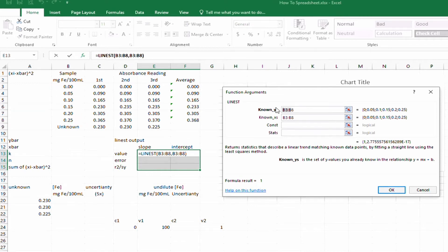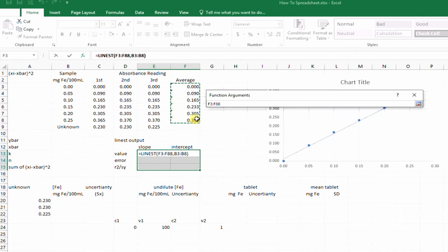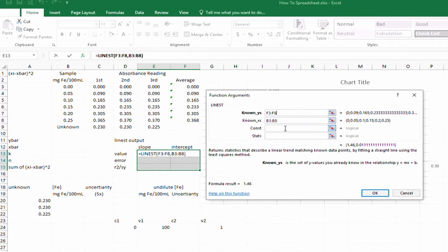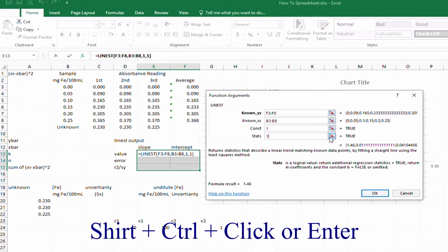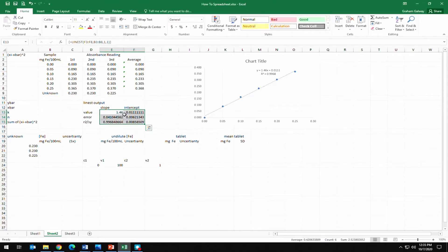Correcting the known x's and known y's — that's right now. For the constant argument we answer with a logical value: true or one, and we want one for the stats as well. Holding down Shift and Control while clicking OK calculates the entire array. We can see the slope matches what's on the chart, as does the intercept. We also have the error on the slope, the R-squared value, and the S_y value. It's always good to check this against the chart to make sure x and y were entered into LINEST properly.